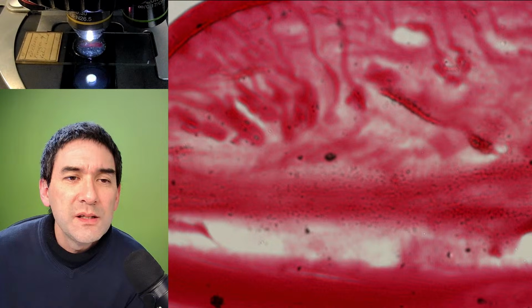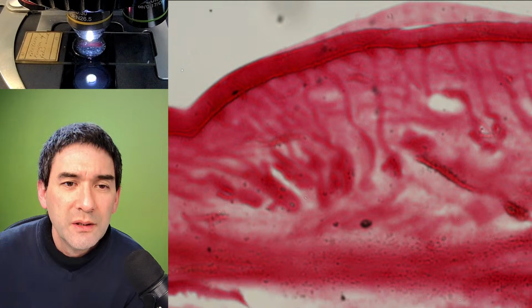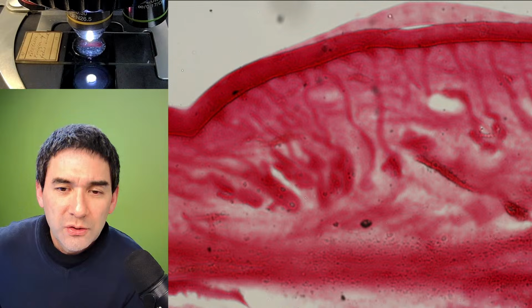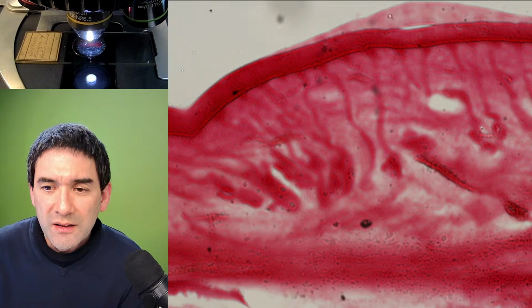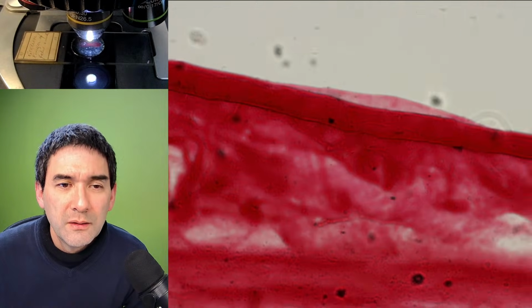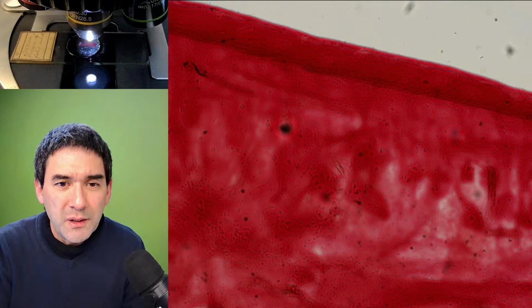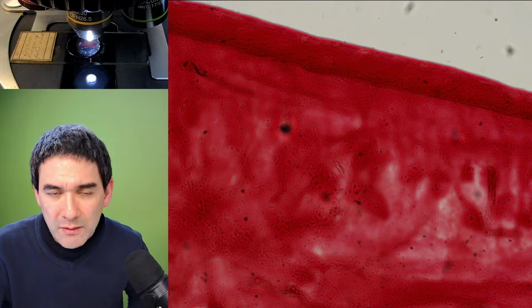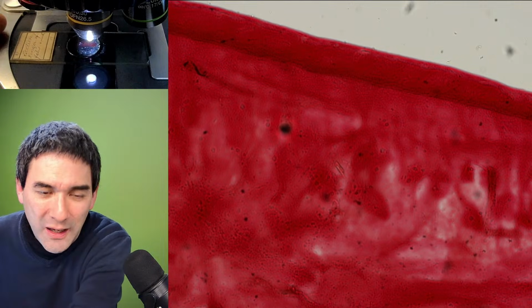These seem to be some kind of sweat glands or so. Yeah, those lines that you see with the little glands which are going out to the surface of the skin. It's an interesting specimen, but not quite as revealing to look at.